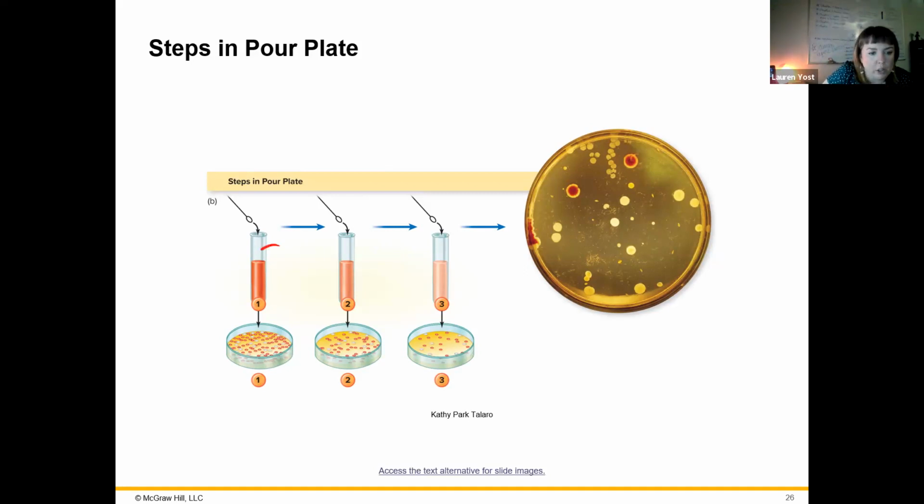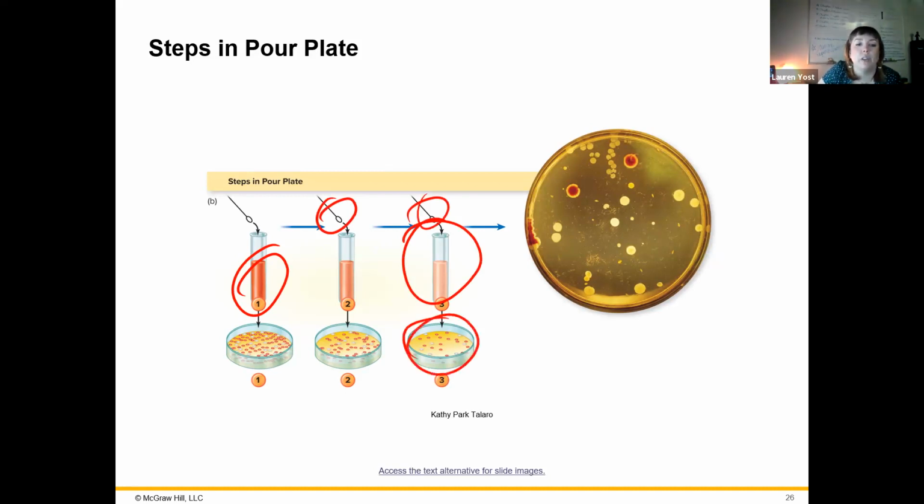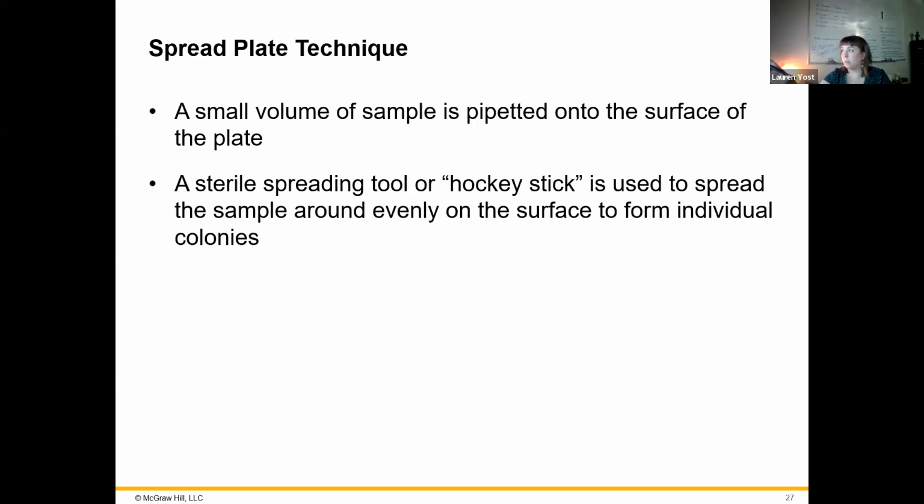Essentially you inoculate this tube and then you mix it in with some agar, pour out, and you can see colonies grow out. And then each of these are diluted out samples that we've put into there, so that we have diluted out and diluted out and diluted out until eventually you can get countable colonies, countable or individual, for isolation or further studying.